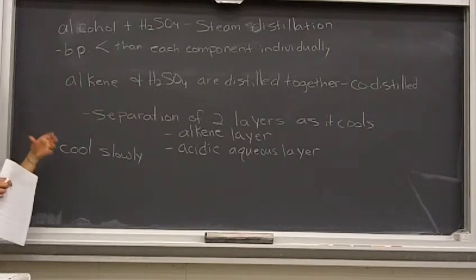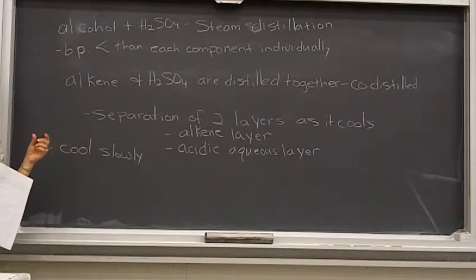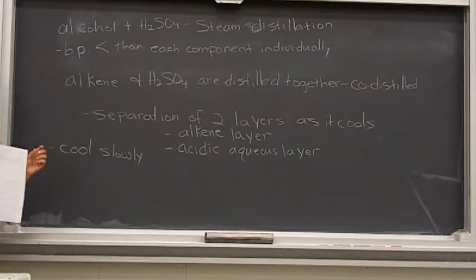And rinse everything very carefully. The other thing is be really careful because you're not going to have a lot of alkene product. You'll have like 4, 5, 6 milliliters of product, and you don't want it to spill and lose all your alkene, okay? Because that's basically 2 weeks worth of work that you don't want lost on the bottom of your hood, okay? So be careful with what's in that grad cylinder.